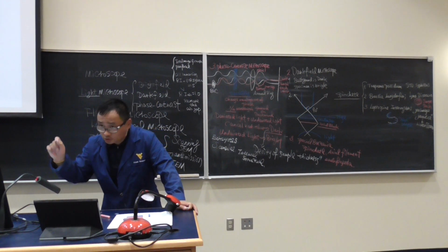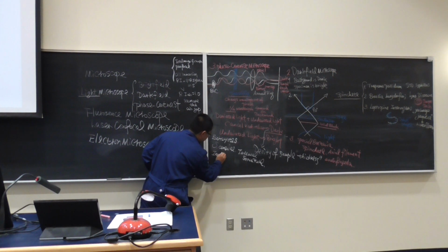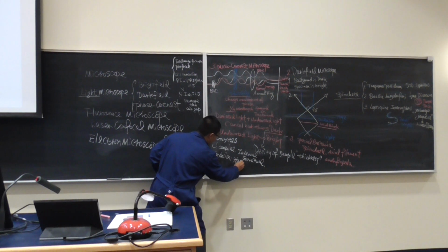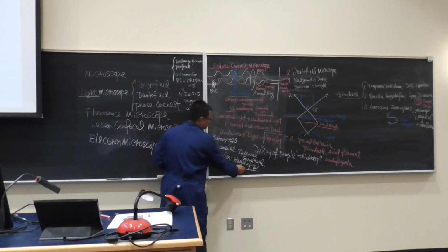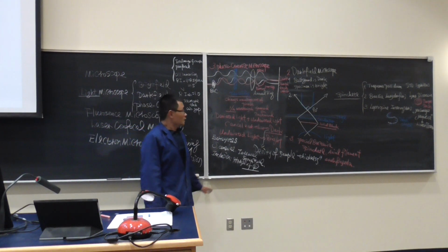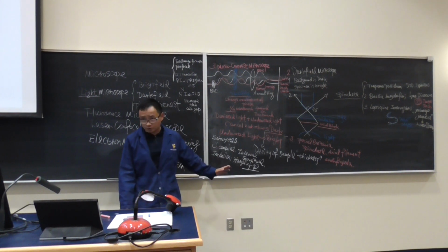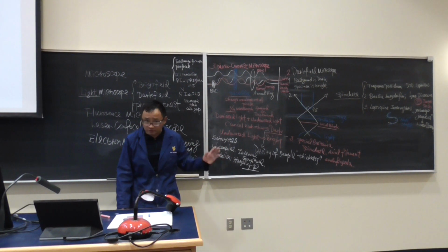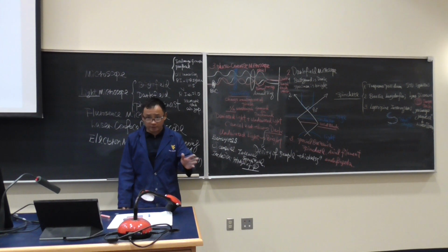And when you see these dots there, those dots are called inclusions. Those inclusions are usually storage of phosphate or some of the chemicals. And you can see it clearly. Now, I want to point out that nobody uses phase contrast microscope too often these days. The reason is we already have the electron microscope.